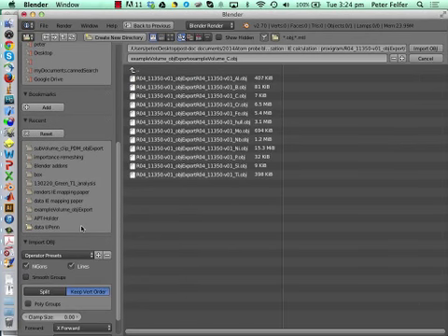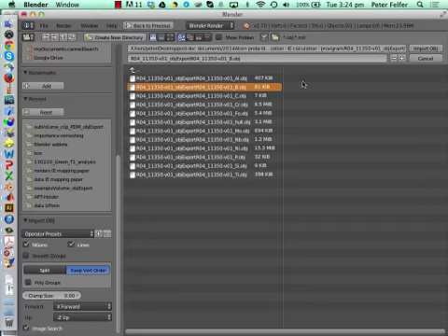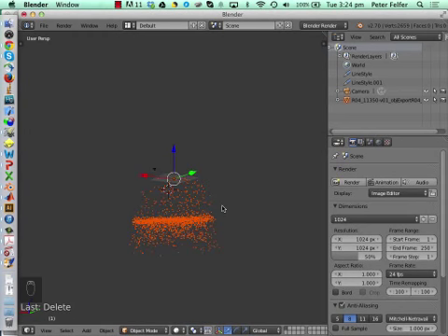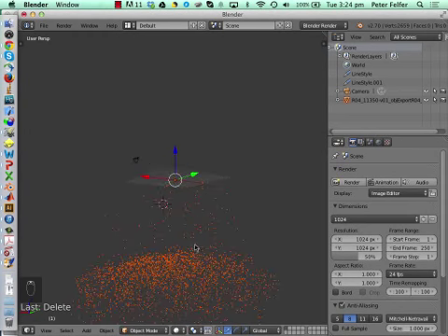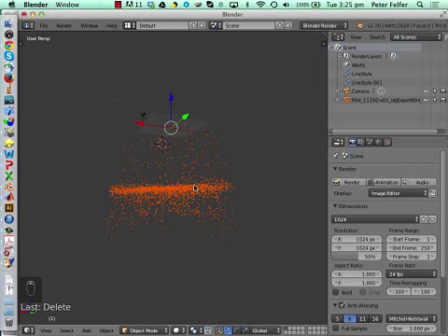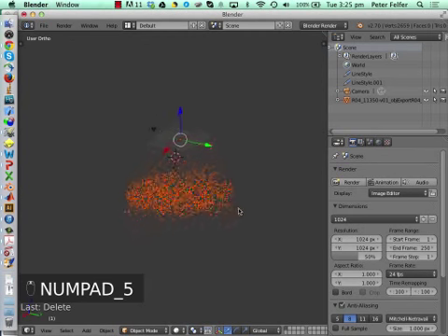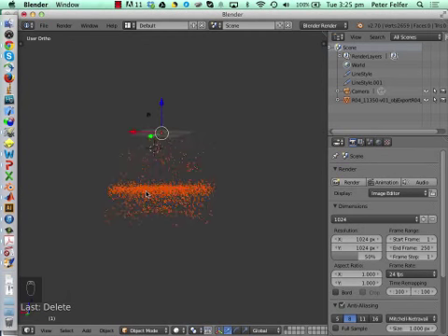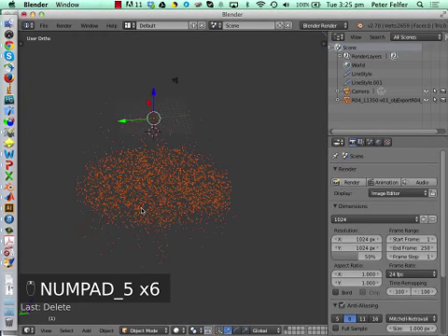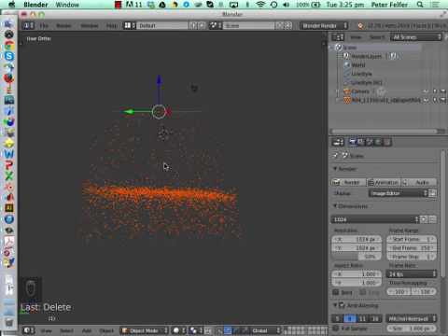And there we go. So I've got all that set up, and now I'll load in the boron because there's a little bit more boron. And if I click Import OBJ now, you can see we've got the boron in the data set. And right now you can see that it's in perspective view, but I think if you work with scientific data, it's always good to press 5 and go into orthographic view, because after all, that gives you a better view on what the whole thing looks like. I mean, you can tell the difference, right? And this is the atom probe data.